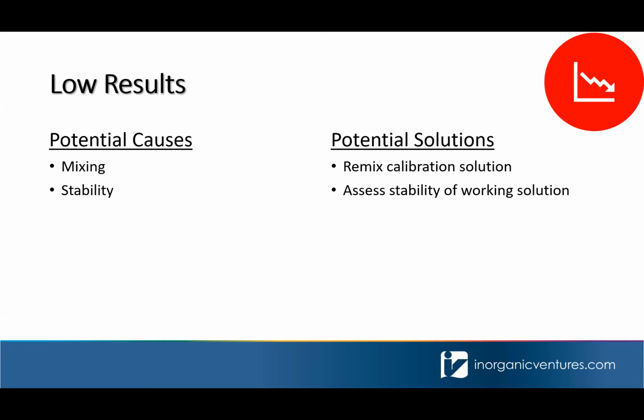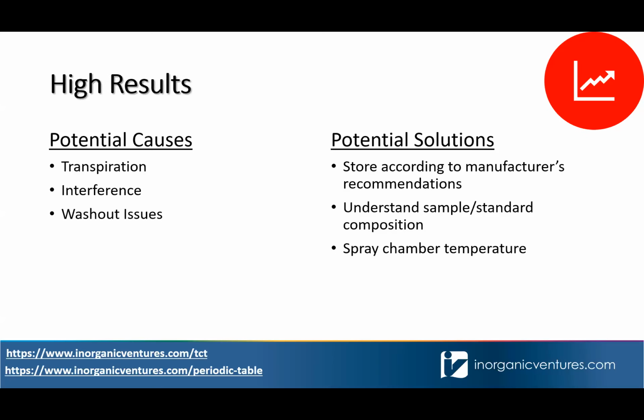So what we would recommend here is to make sure you're assessing the stability of your working solution. If you're using those over a period of time, make sure that you're following the guidelines that I set forth in the beginning of the presentation to ensure that you have the most stable situation possible. Okay. And then high results.